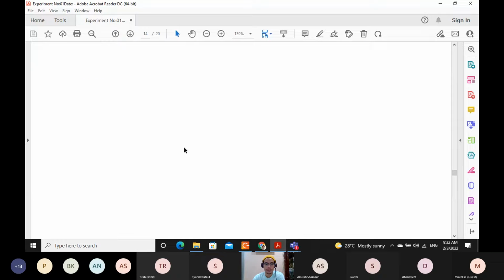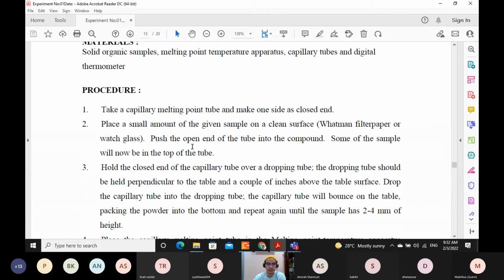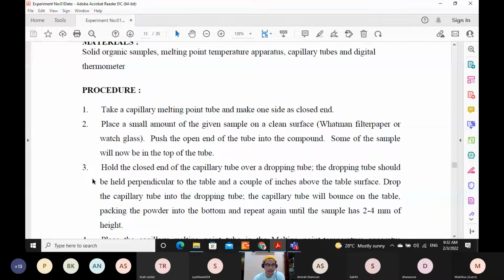Okay, so really simple. If we are in the lab, saya akan campur experiment 3 ni usually with experiment 4 and also 5 sekaligus: melting point, refractive index, dan juga pH test sekali. Because short je, simple dan singkat, tak ambil masa yang lama. Cuma kena share lah. That's why saya akan campur with other experiments. So one group buat experiment 3 dulu, and the other buat experiment 4, and the other boleh buat 5. Dan bila ni dah habis, tukar. Okay?